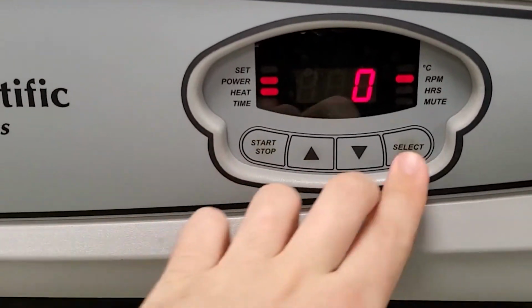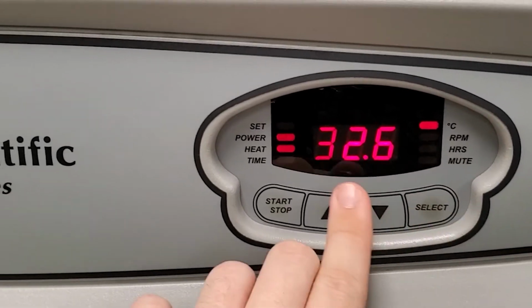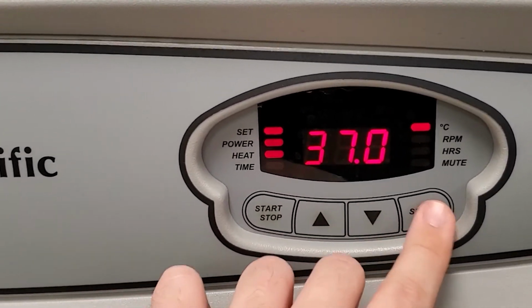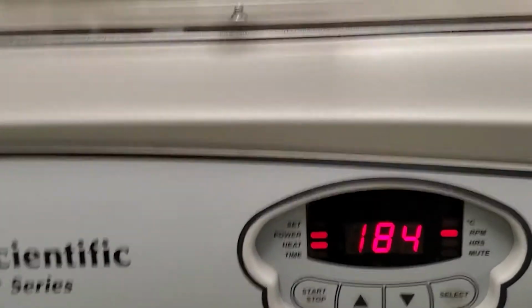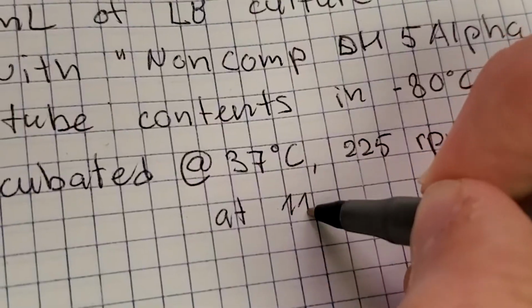Set the incubator to the right temperature and shake in RPM, and make sure the machine is running. Take note of the time and date to properly document your experiment.